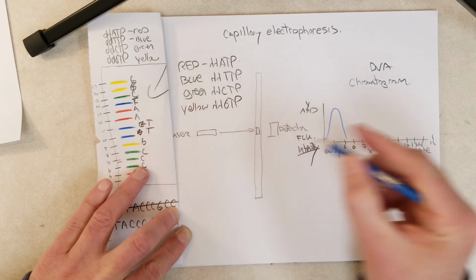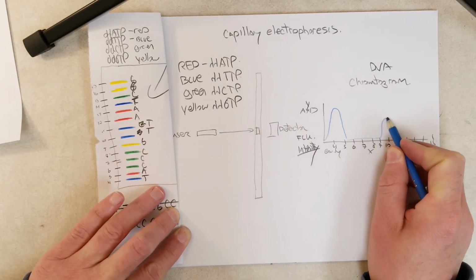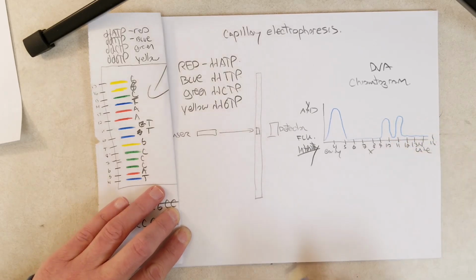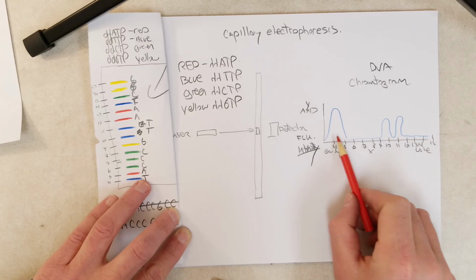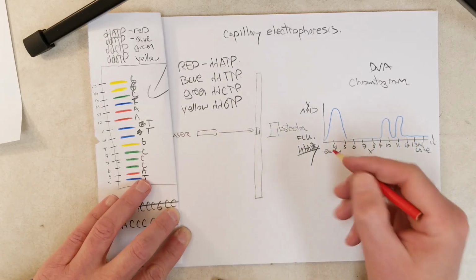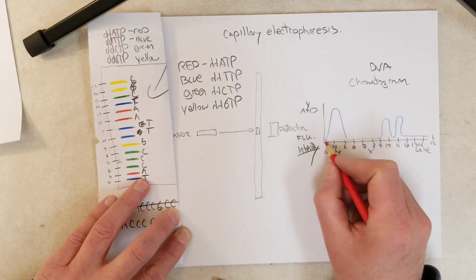Okay, so the next time we're going to see blue is way down here at 10 and 11. Oh, so we get a blip at 10 and a blip in blue at 11. Okay, so it's not like it's going to do all the blue first and then do other colors next. The whole time, it's still going to be looking for red, green, and yellow colors too.